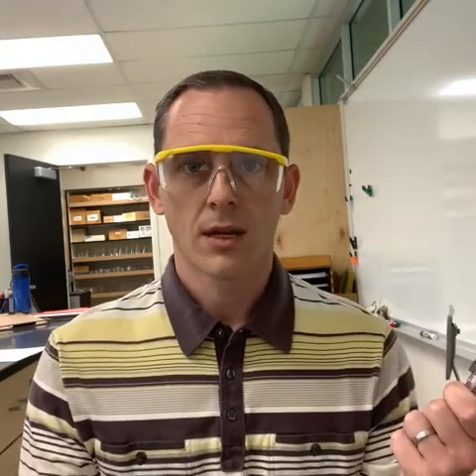So if you look back in some of our earlier notes when we talked about accuracy and precision, I told you guys how to calculate percent error. How do we see how close we got to the true value? So I want you to take your experimental density of water and compare it to the theoretical density of water, which is 1.000, and see what our percent error was.